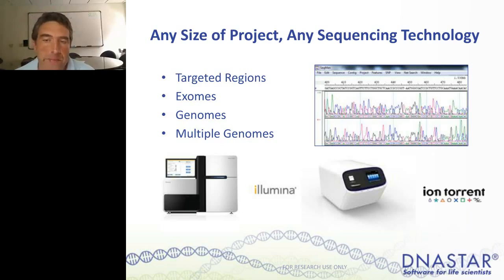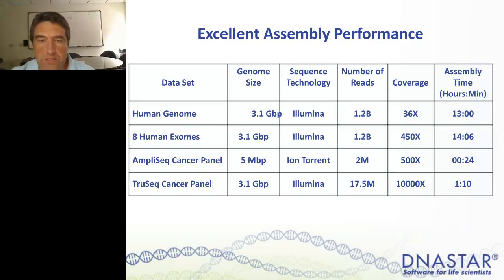So the software has to be designed to be flexible enough to accommodate not only different platforms, but also different workflows. I'll show you some of the interface today on how we can set up projects. And today in particular, we're going to look at accuracy measurements and how we can verify accuracy when we're using different platforms and different types of projects.